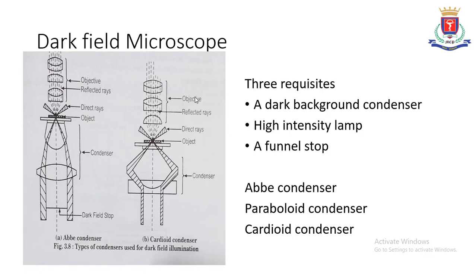The cardioid condenser is best employed with strong arc lamp. Ordinary glass slides and cover slips are not used because of high concentration of light. It is better to employ fused quartz object slides and fused quartz cover slips. The cardioid condenser is especially designed for examination of colloidal solutions and suspensions.